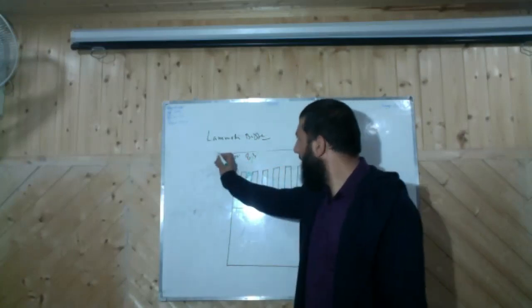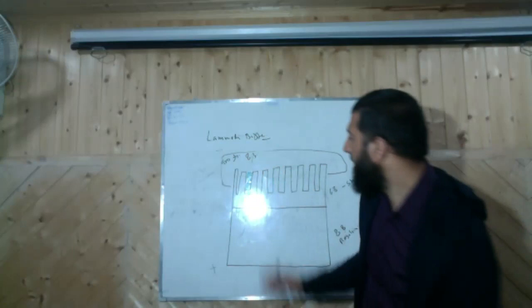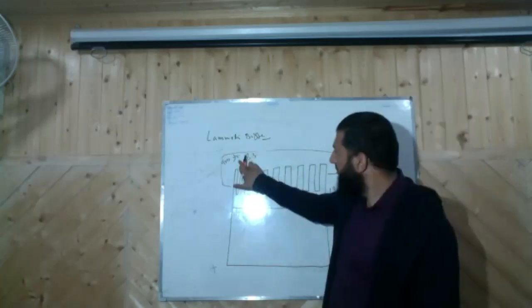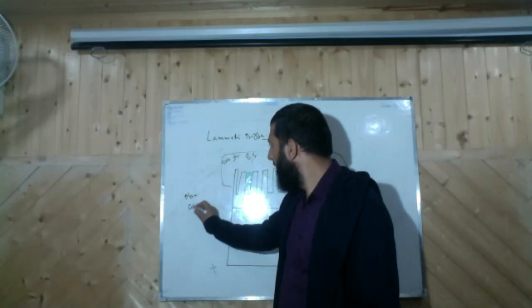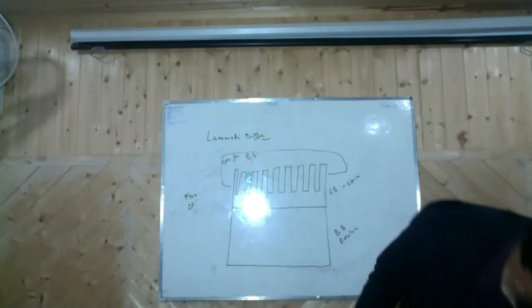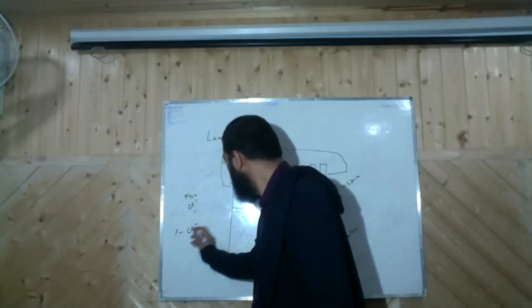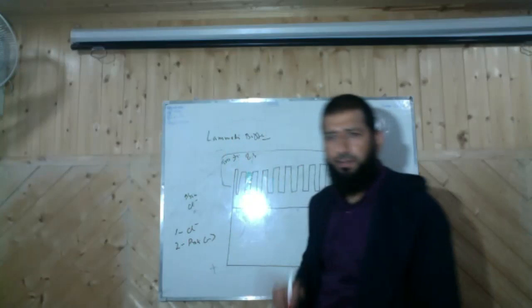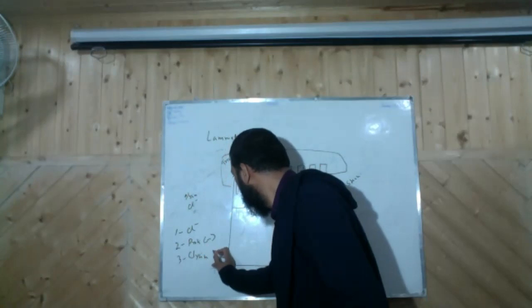So when we apply negative and positive charge, or run it in an electrophoretic tank, the electrophoretic tank of SDS is different from electrophoretic tank of agarose gel. So what happens here? You have glycine ions furnished, plus you have chloride ions. Chloride ions, because this gel is made up of Tris HCl. Okay, the chloride ions are furnished from that. Chloride ion have a negative charge. Protein have a negative charge because of SDS that we have added to it. And glycine also has a negative charge.